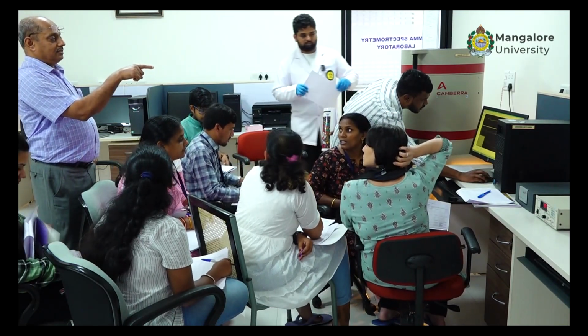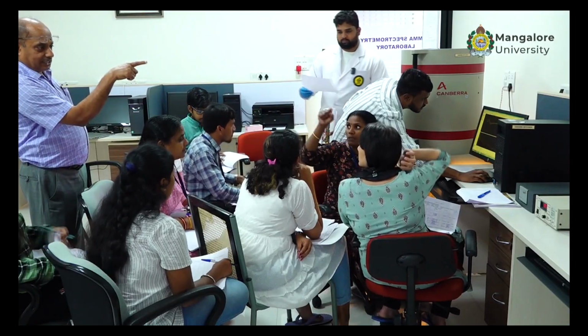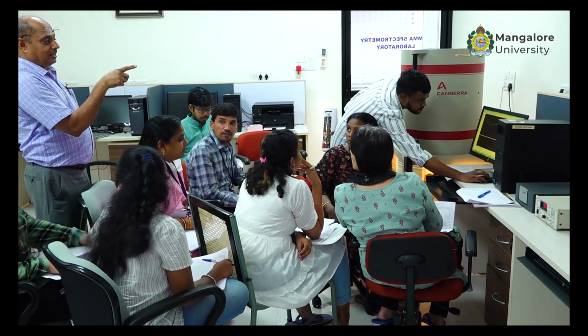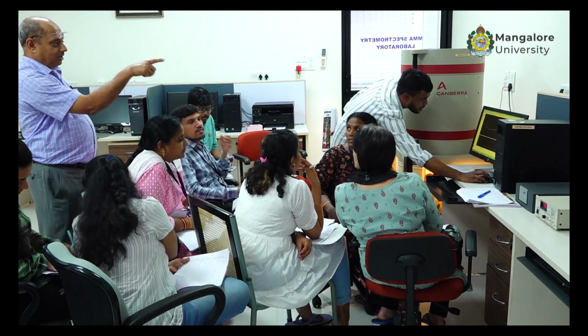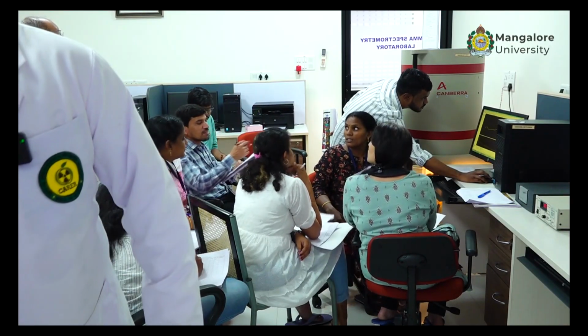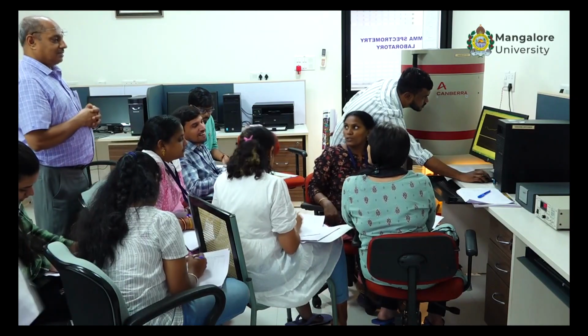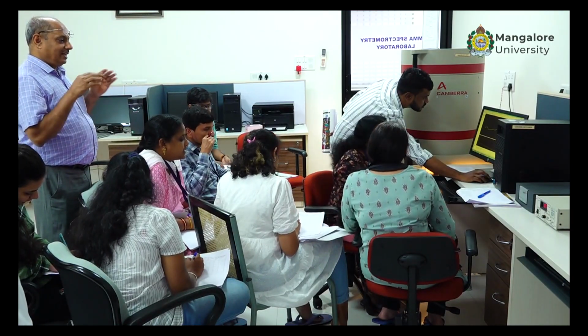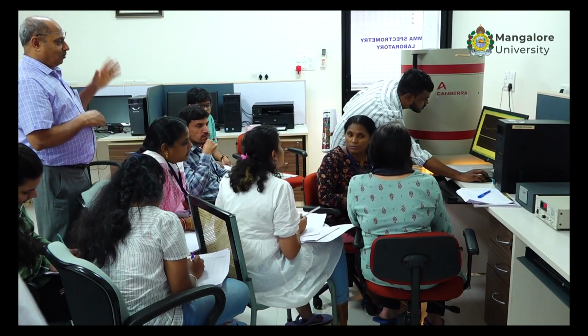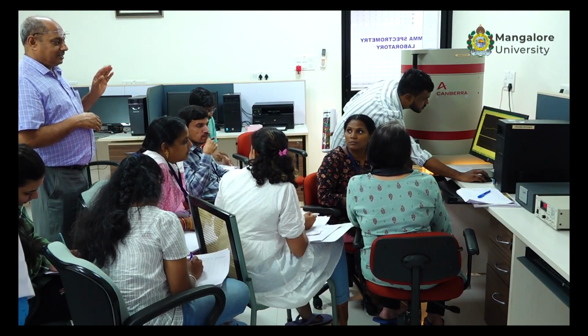See, if you place the cursor at the peak, that will give you the energy. That is the importance of energy calibration. Place the cursor at the peak, it will give the energy. Then you look at the data. This energy corresponds to which one? That's why we wanted you to do the calculation. So what is the purpose of energy calculation?